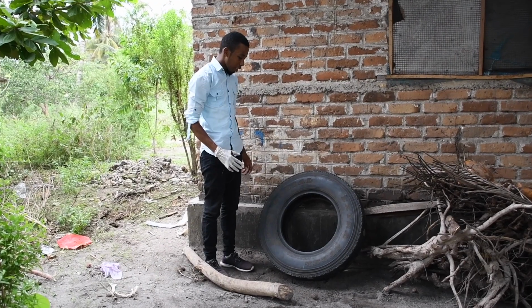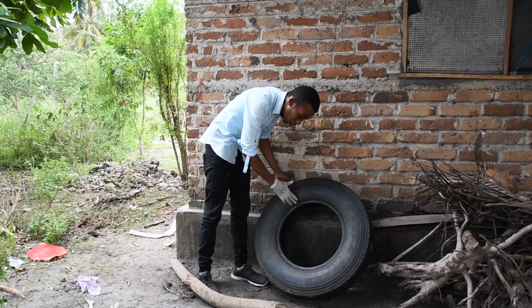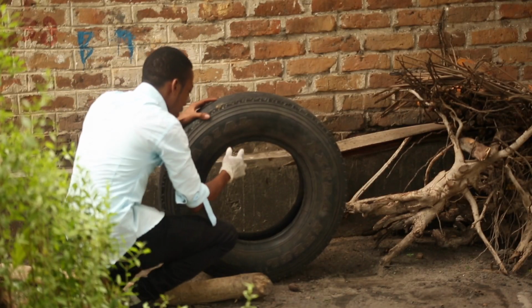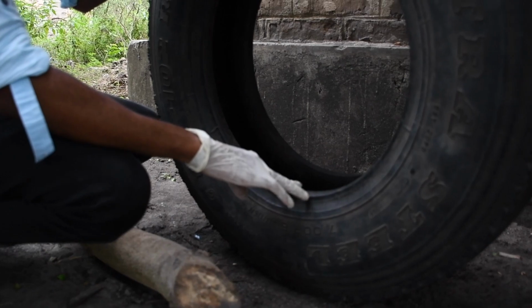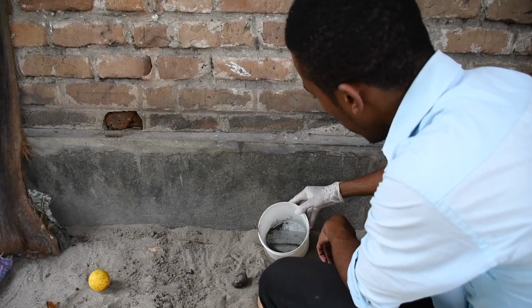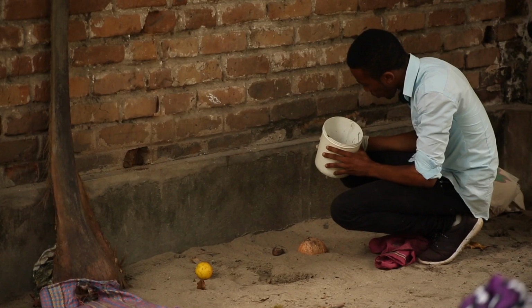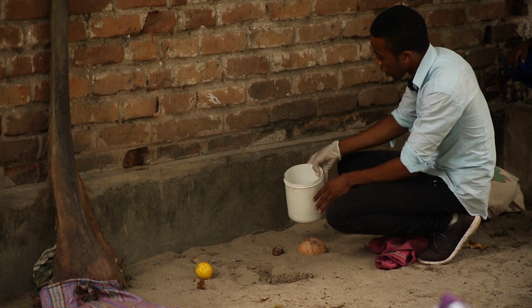A lot of containers that may seem unlikely can act as a breeding site for mosquitoes. For example, this tire can collect water during rainy season. You will see that there is a certain amount of water that collects, which acts as a perfect breeding site for Aedes species since the water is clean and clear, and it's also near to the household. So we can search and see if there are any larvae or pupae that have formed. So this is a negative container. So we search the surroundings.